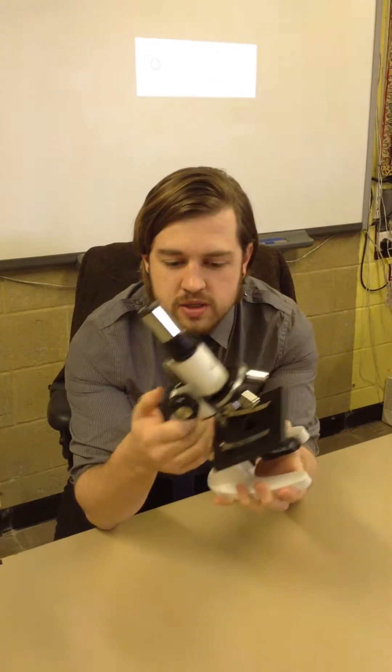Now, the arm of the microscope is where you should pick up the microscope in order to carry it and move it around the classroom. So when you go to collect your microscope, it's very important that you only pick it up using the arm of the microscope. Don't pick it up using the top part or any other part just in case you break it.